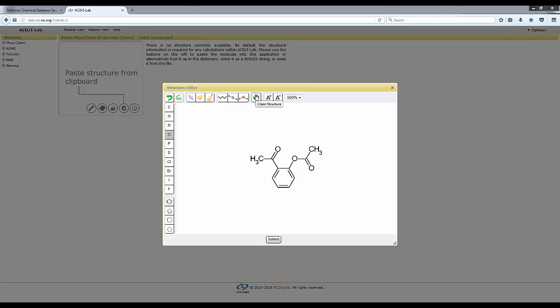Okay. Now there are a few things that you can do here. Of course, you can add other elements. A very important function is the undo function. So if you undo, you go back to where you were, or you can redo, as with most software. We saw the eraser. There is the select tool. There is the clear all tool. So if you click this, everything will be erased.